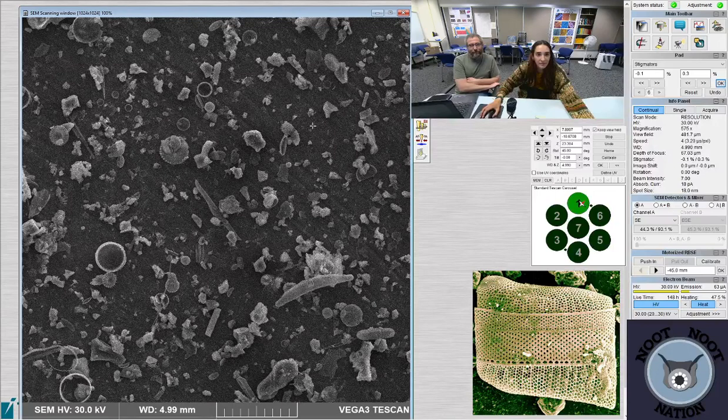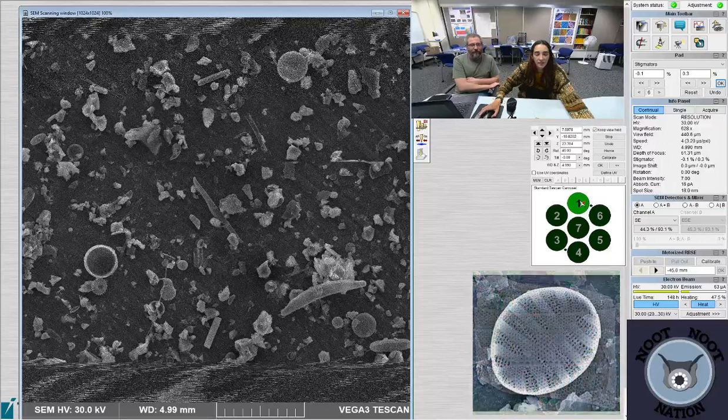Where we look at the June Gull Lake connection and the evolution of the diatom that I named from this lake system, Stephanodiscus caruscus.